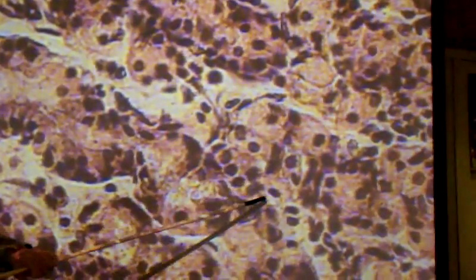Here's another parietal cell right here — there's another one right there. Looks like we've got a cluster here, here, here, here, here. On this slide again, it's kind of subtle.